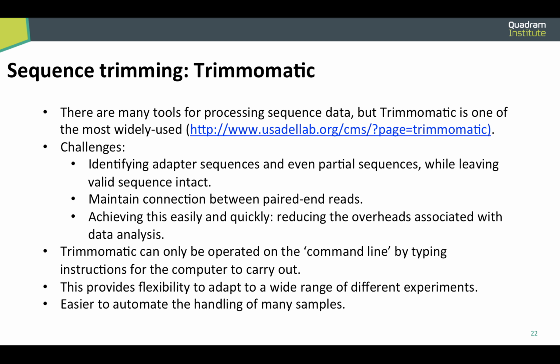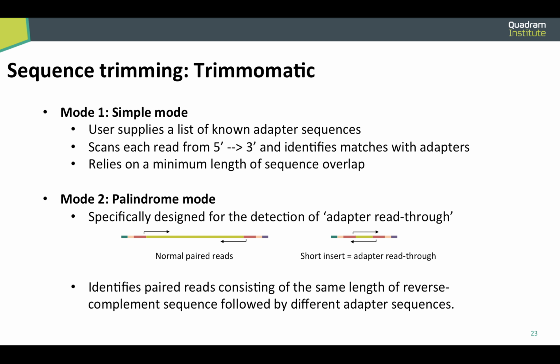Unlike FastQC, Trimmomatic can only be used in command line mode. And so you won't be able to sort of go on the internet and just upload samples, perhaps in a way that you might be more used to. But hopefully by the end of all of our demonstrations that we're going to go through, we'll have a reasonable idea of how to use command line tools. And we will use Trimmomatic in one of the upcoming tutorials.